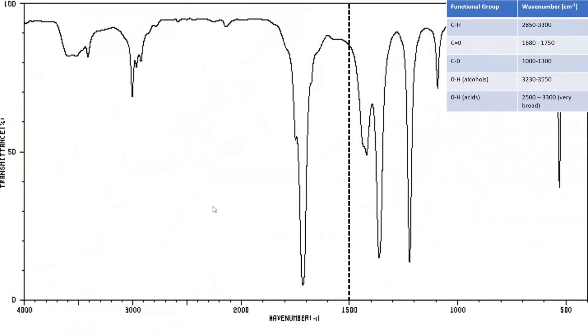Let's look at another example. We've got something very different here. This is propanone, and I'm telling you that straight away. We've got a peak here. This is our C=O, which is totally consistent with having propanone.